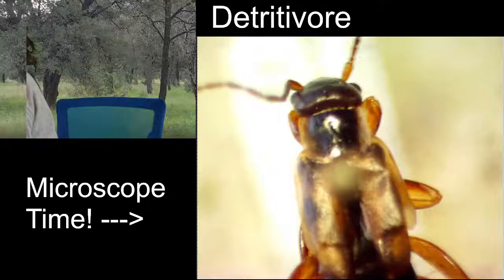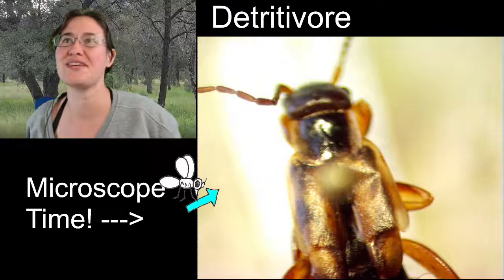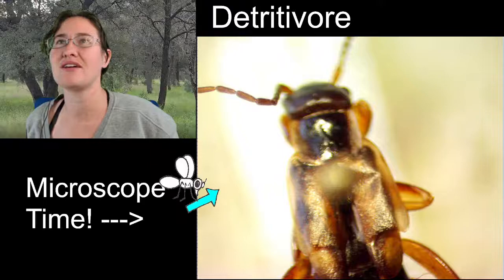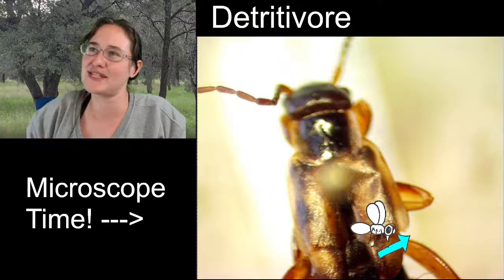And the tegmina are also the same way. You can see the edge of the body through it. So, come on, Terry. Terry doesn't want to be selected. There we go. All right. If you see right here, you're actually looking at the body, and this is the tegmina that comes out a little bit further over the edge.